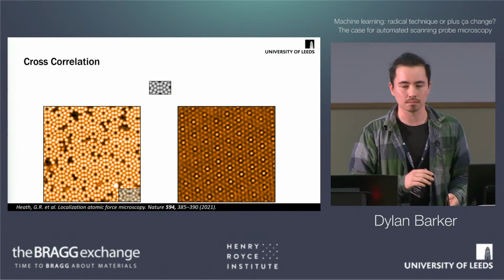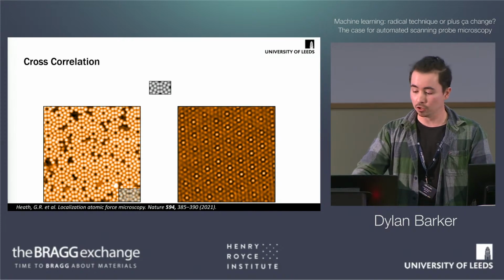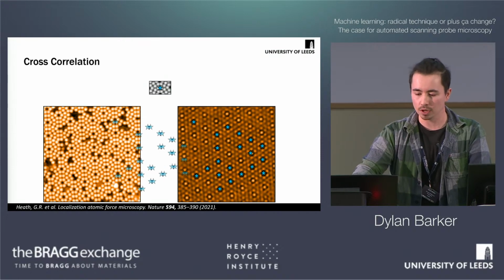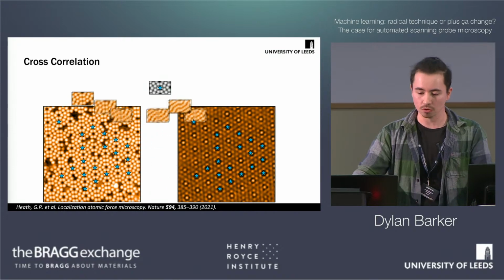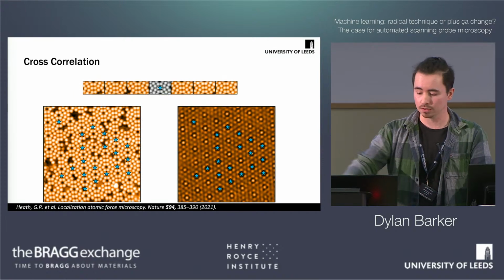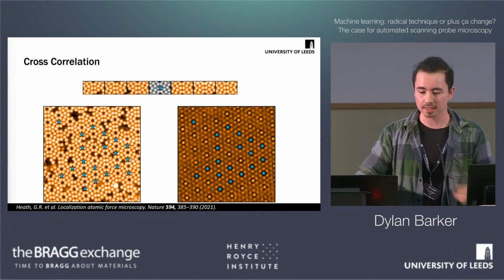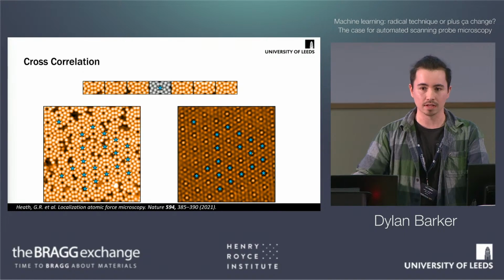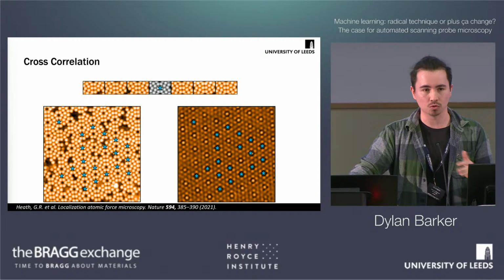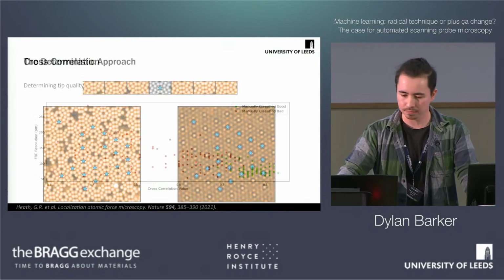And then we get this cross-correlation map on the right. You can see all the peaks here. If we take, say, the top 20 of these peaks, map them over to our input image and take them out, we can see it's doing what we're expecting, and it's pulling out all of these unit cells from here. Then if we take the average of the actual number that's output by this, we get an average of how highly correlated the input image is with our reference image. So we get an actual metric for how good the correlation is there.